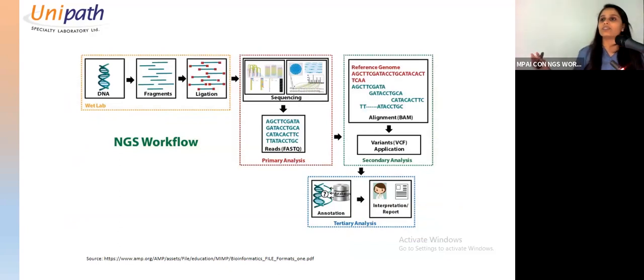This slide is already covered. This was the end of a session where he told us about the basic workflow which is followed for the analysis. I know you mostly would be from a wet lab background or pathologists, so it's actually difficult for all of us to understand this flow. But as Dr. Neeraj already gave you a brief overview, we start with DNA fragmentation, which is the library preparation. After that, it's carried on with the sequencing, and then you have reads in FASTQ format.